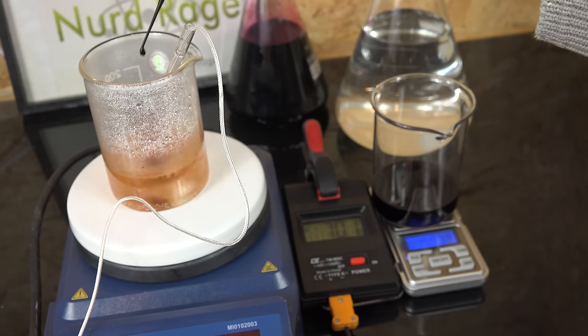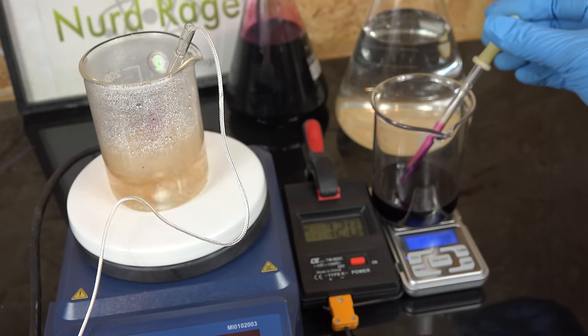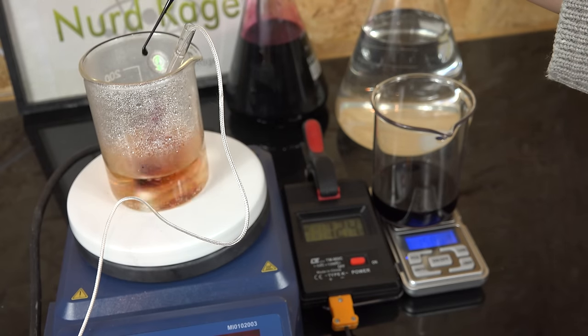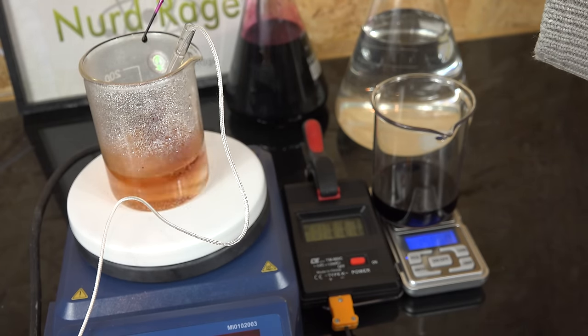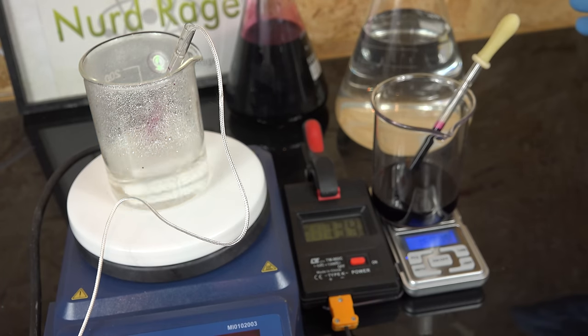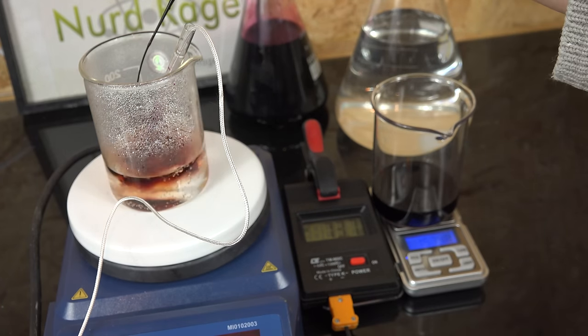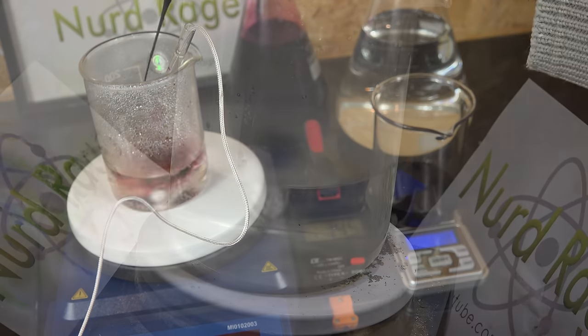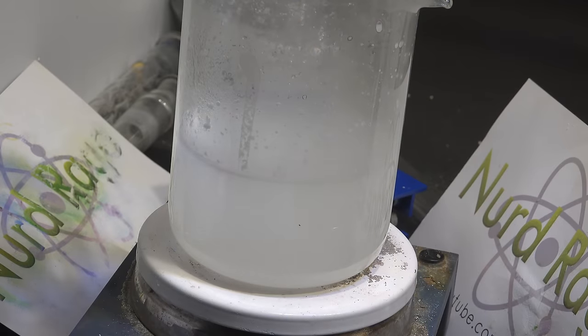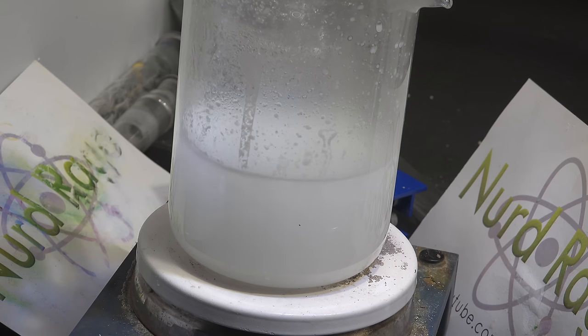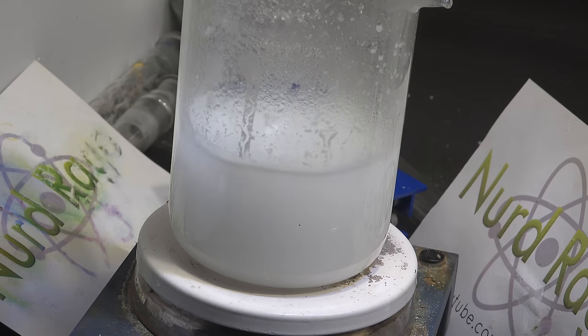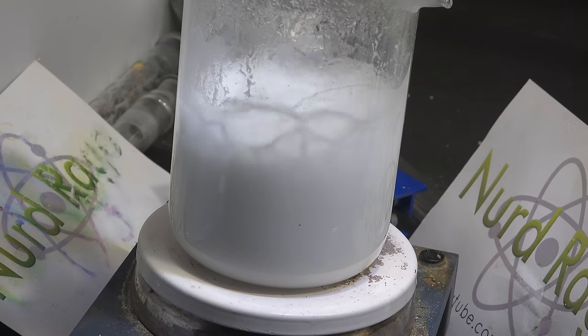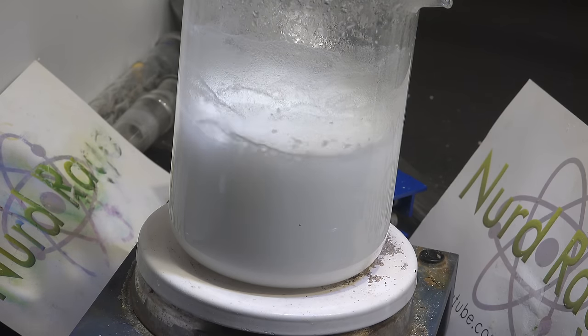The process of measuring and calibrating our titrant is called standardization. To standardize potassium permanganate we need a reference standard of high purity, stability and simple definite chemistry. These standards are also called primary standards or analytical standards. They're kind of like calibration weights. For potassium permanganate a common primary standard is sodium oxalate. And we made that in a previous video. It's convenient for the amateur since it's easy to make and purify.